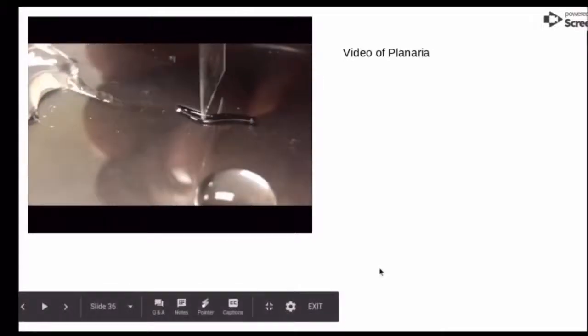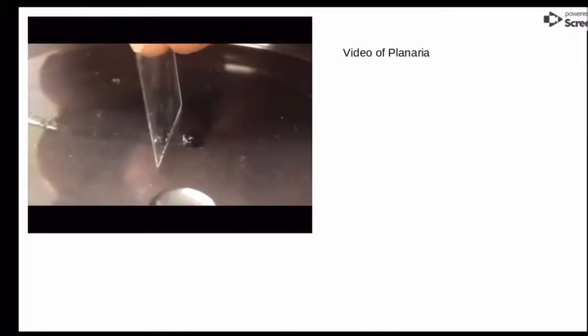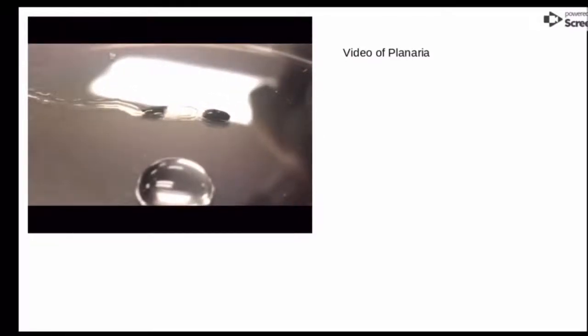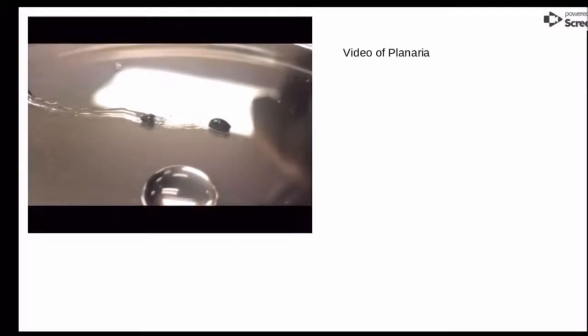So we're gonna be about ready to cut it with a cover slip. And then here you can see it's being cut, and the 2 organisms can still live. And that was fascinating to all of our group. So first, you go up here.